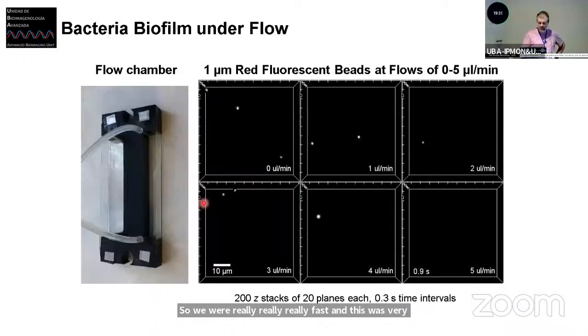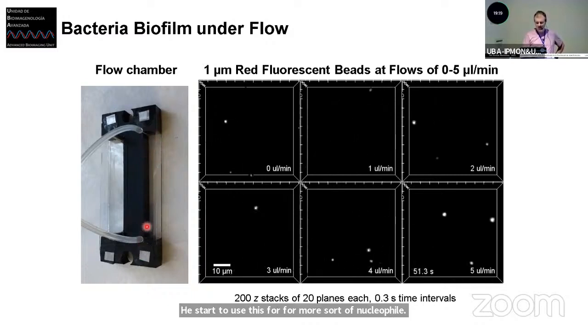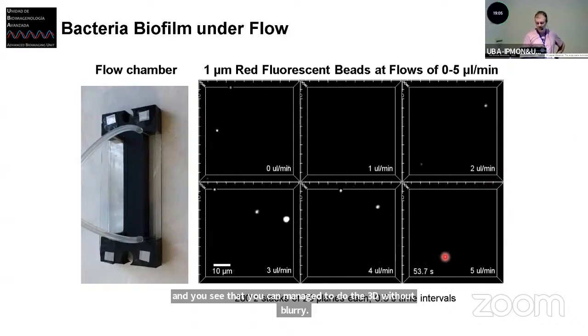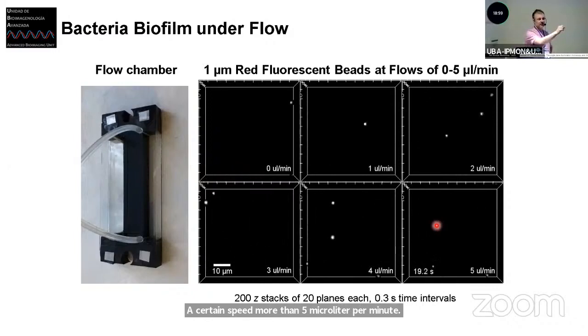So we were really, really fast, and this was a very powerful use that we found for this microscope. And then Nick, with a collaborator, Shivab, started to use this for more microfluidic work. This was not micro at all, but basically they can see some flow. And these are 3D stacks of beads passing through the volume. You see that you can manage to do the 3D without blurring up to a certain speed; above 5 microliters per minute you struggle to do the stack before the next frame comes, and you see the smear of the bead passing through the volume.